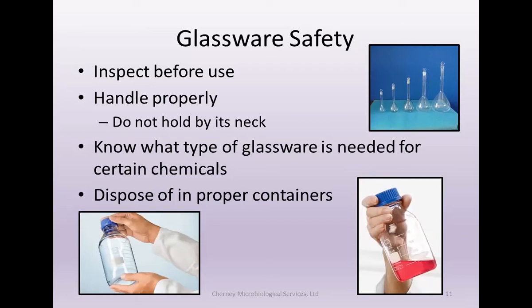And I've seen technicians take a hot bottle of agar and hold it over their head almost to hold it up to the light and see if there are any unmelted chunks of media. And that's a very unsafe practice because I've seen the bottom of those bottles break open and you would just hate to think what would happen if that had occurred to that technician. So it's also your responsibility. If you see something unsafe, make sure you say something.